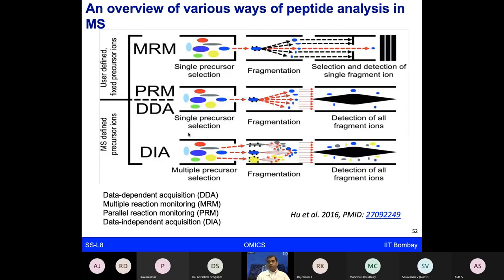For doing this kind of work, there are different approaches people use in the mass spectrometry field, with some complex terminologies. One is known as DDA, or data dependent acquisition, the other is known as data independent acquisition, or DIA. Again, just think about the basic concept. We are looking at how to select the most intense precursor ions, and how to fragment those. All the tricks lie there.